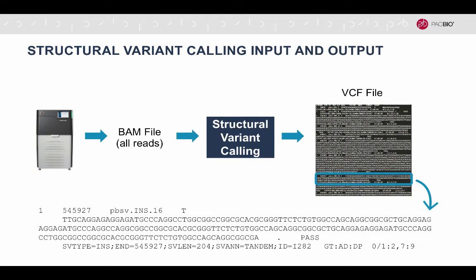The input to a structural variant calling analysis is one or more BAM files generated by a PacBio sequencing instrument, and the main output is a VCF file of the called structural variants.